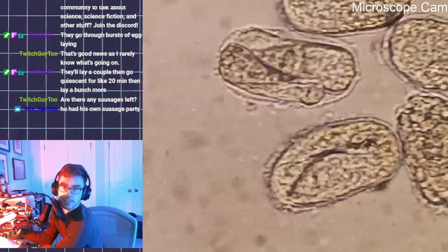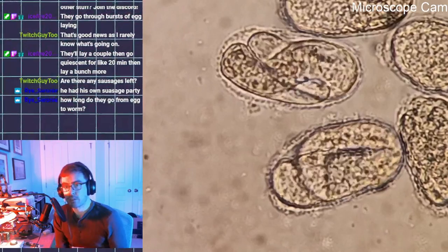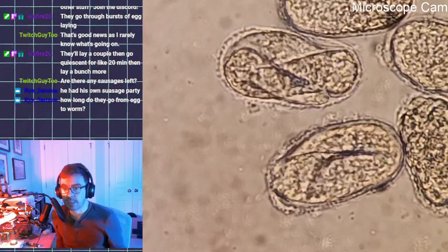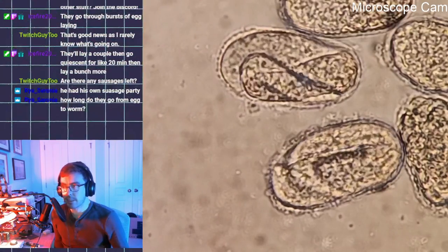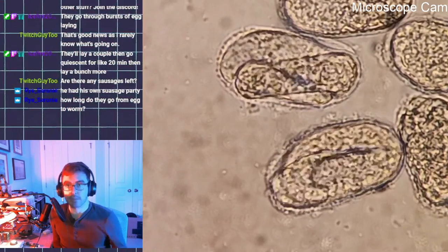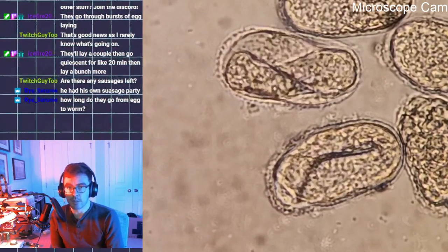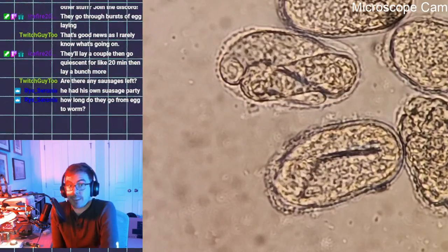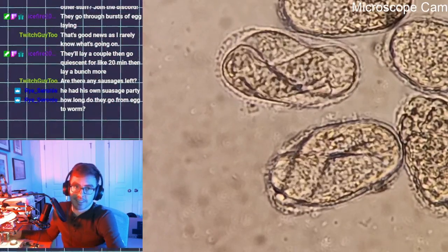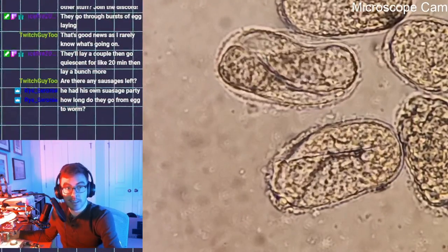Just trying to center this. They're waiting to be born. How long do they go from egg to worm? So I looked this up previously on stream. It sounds like about 13 hours from the time that they are fertilized, which happens inside of the worm. I don't know how long it takes to go from fertilization to hatching, but not too long. So these were fertilized sometime last night, potentially while I was still having my party. Actually, I guess it didn't go that late, so no. It doesn't take that long at all, really.